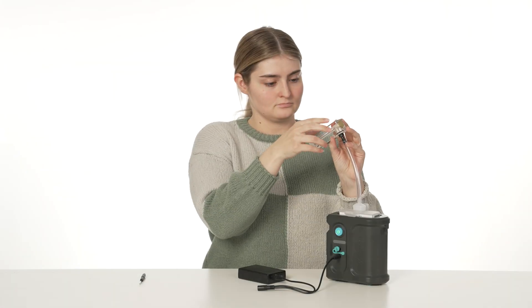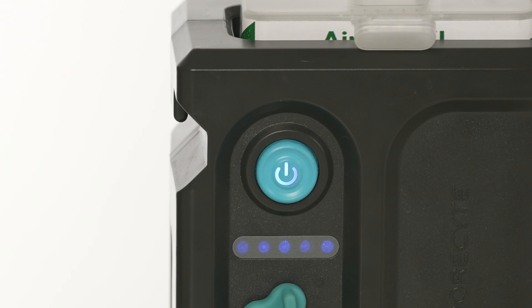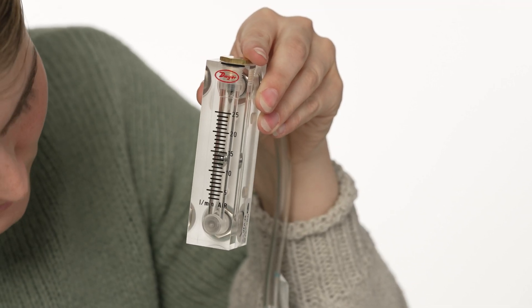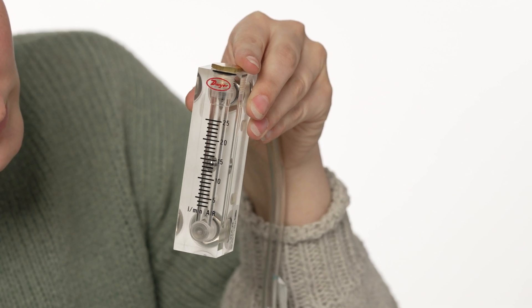With the cassette and rotameter now attached to the pump, turn the pump on and observe the flow rate measured on the rotameter. The rotameter should be read at the center point of the round float ball and held level for accurate readings.